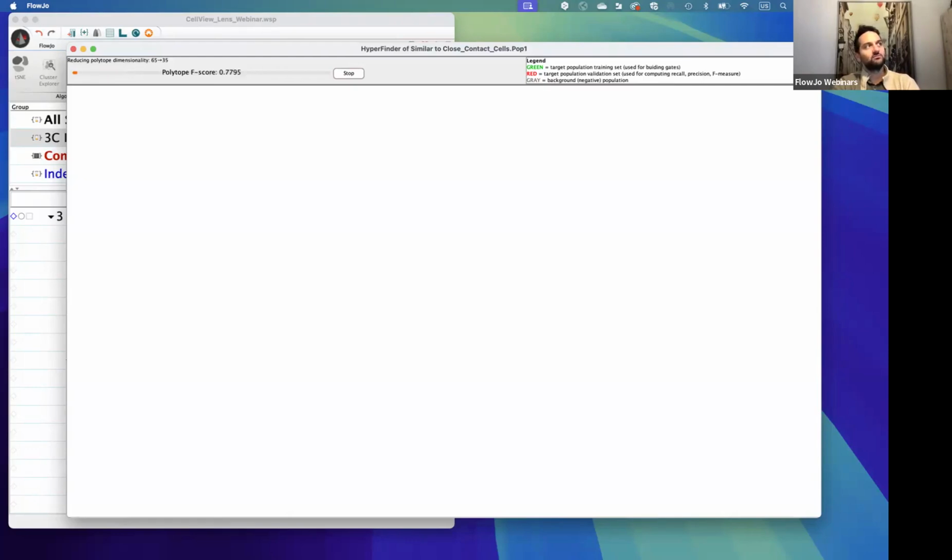So there's no way at the moment to find the best number there. But if you select 2,000 nearest neighbors, it could be one neighbor too far away, right? It will still calculate this and put it in there. So yeah, that's a difficulty we're having. But to quality check that, maybe you can start with a number and see if you have impurities in there that you decrease significantly.